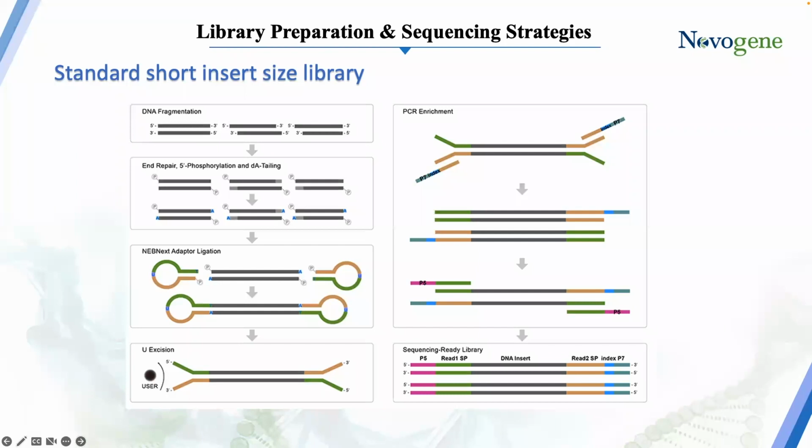And in order for us to do that process and then perform sequencing by synthesis, we need to have adapter sequences added to the end that are complementary to the oligos that are on the flow cell. So it can actually bind, stay in one place, form a cluster, amplify, and then be sequenced and show as a clean signal on the lane that we can then call as base call, right?